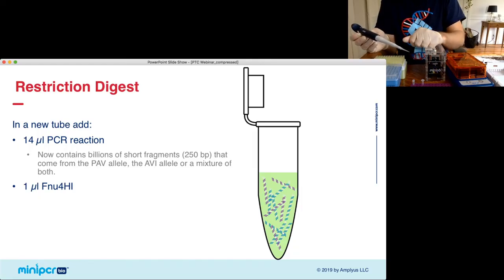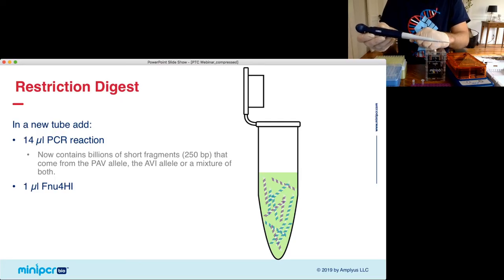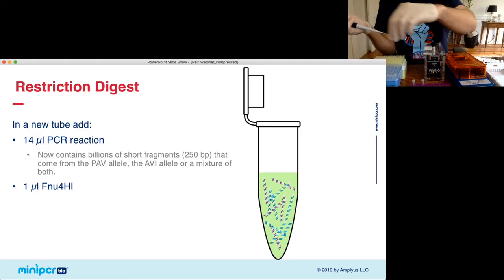Restriction enzymes are fairly expensive, and so you don't want to mess this stage up. 1 microliter is very small. So no offense to students out there, but your pipetting skills are usually, well, they're still growing, we could say. And so we don't want to mess it up that way. And then finally, a lot of times you might have just 1 10 microliter pipette in your classroom, where you probably have a larger set of the 20 microliter pipettes.